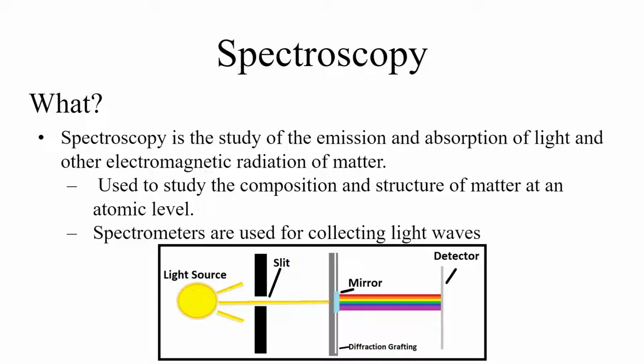The most basic design of a modern spectrometer can be seen below, where you have a light source, which passes light through a slit onto a diffraction grating, where a mirror can be used to focus onto a photodetector. The light that reflects onto the detector is picked up by individual wavelengths.